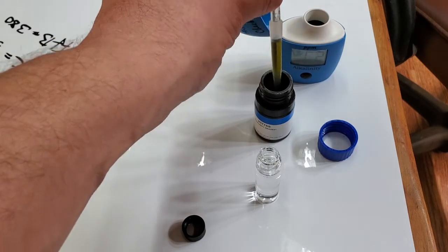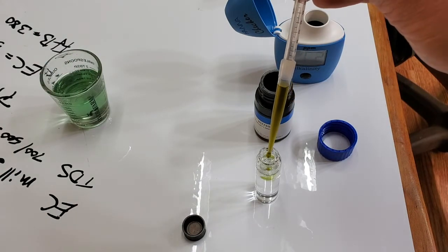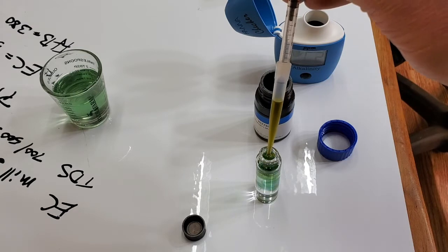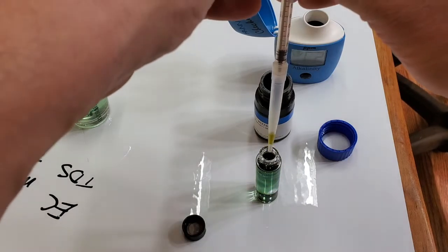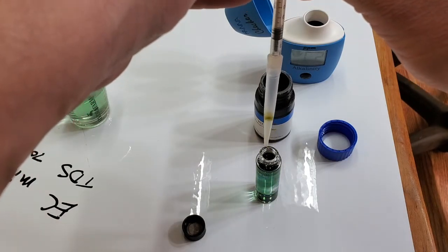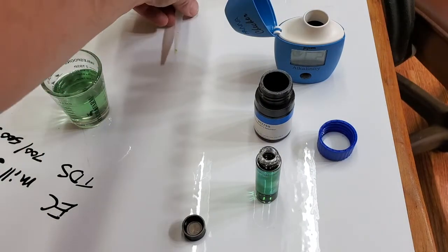We've got one milliliter of reagent — add it to the sample and you'll see it start to change color. This is a handheld colorimeter; it tells you alkalinity based on the color of the sample.